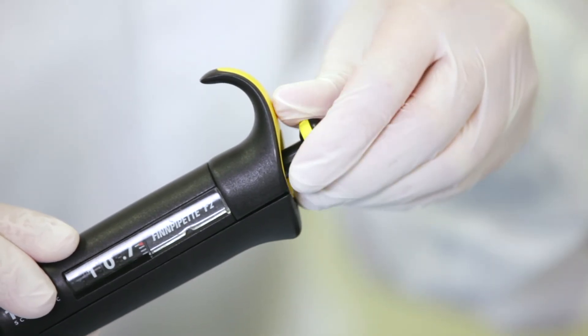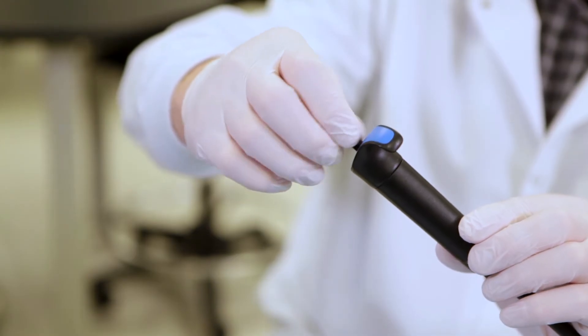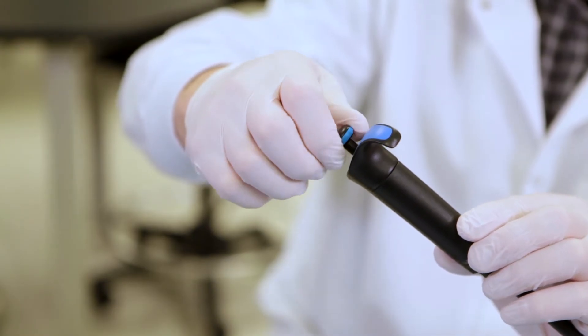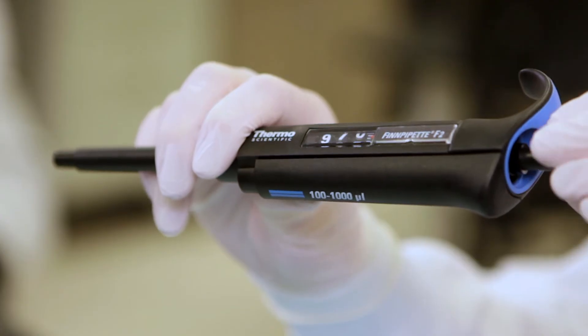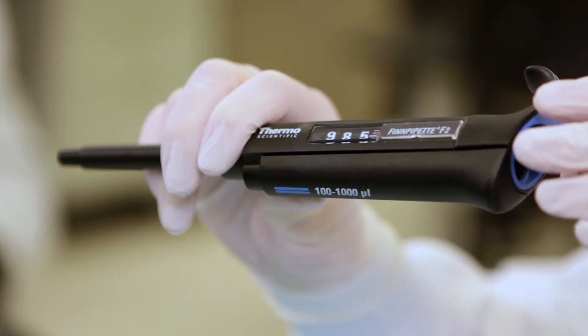Remember the dial numbers indicate different volumes depending upon which pipette is used. You should never use a pipette to measure volumes outside of its intended range. Doing so can cause inaccurate measurements and will damage the internal mechanisms of the pipette.